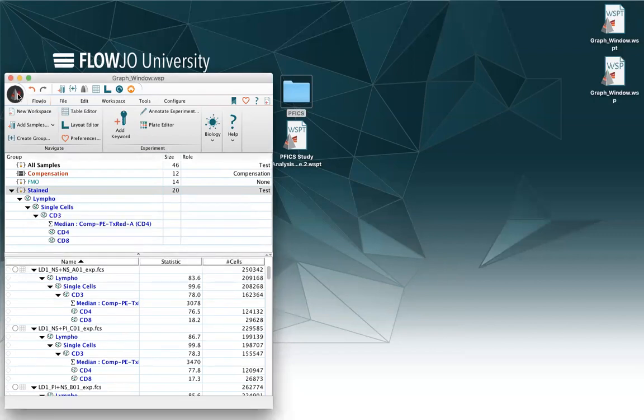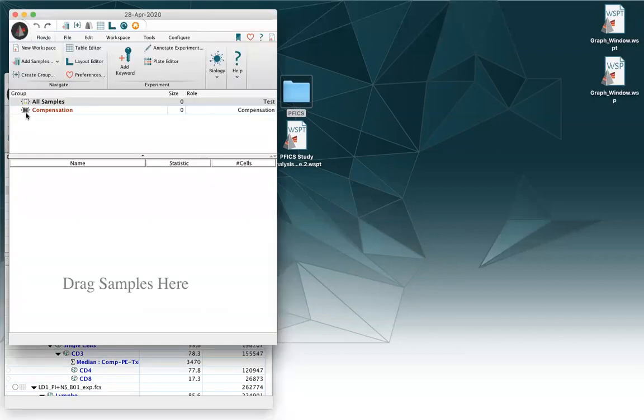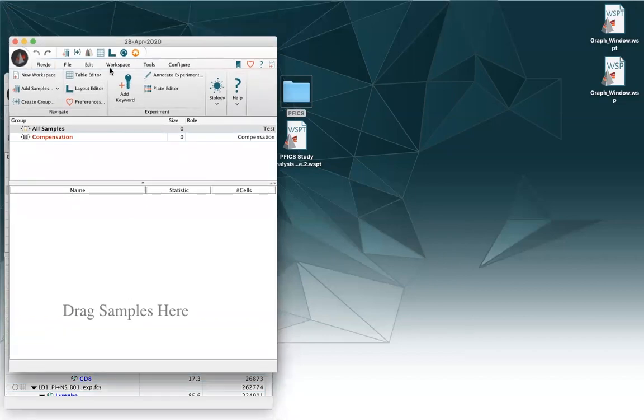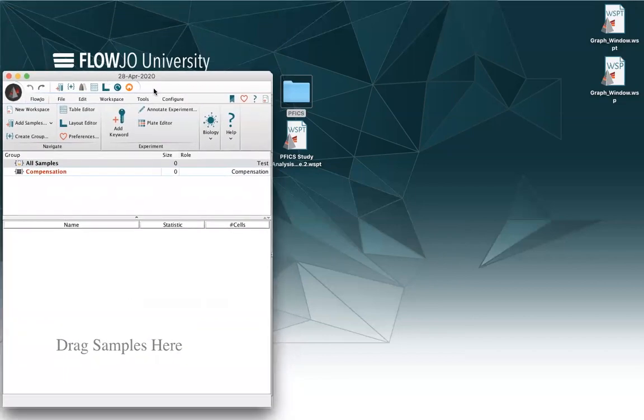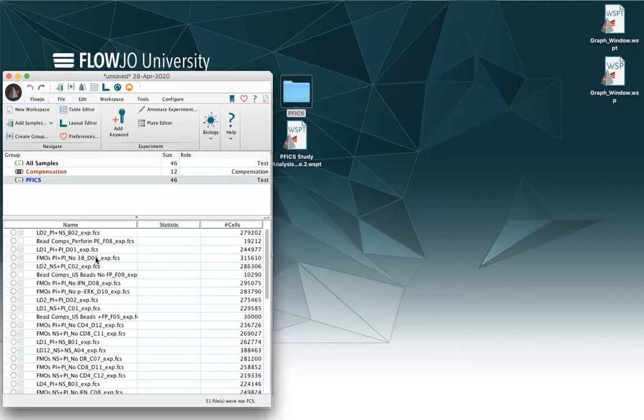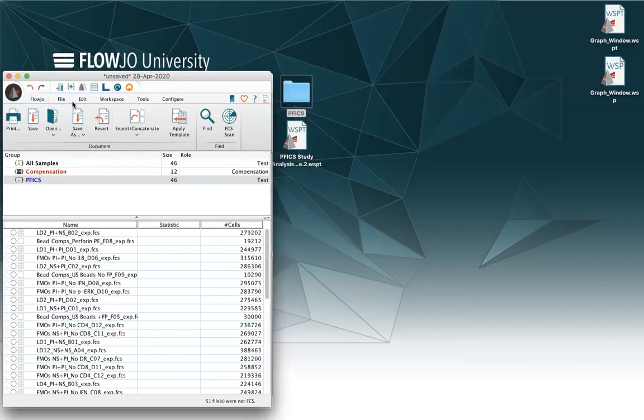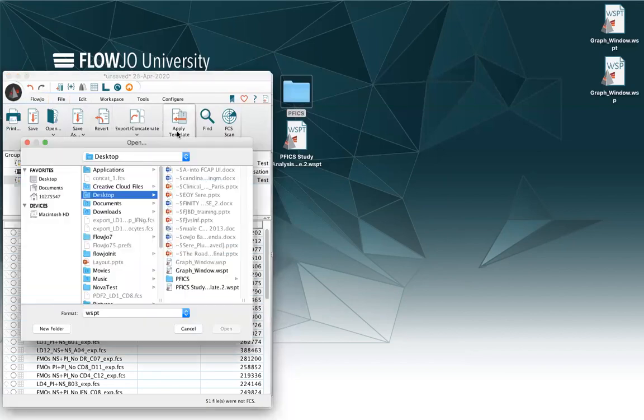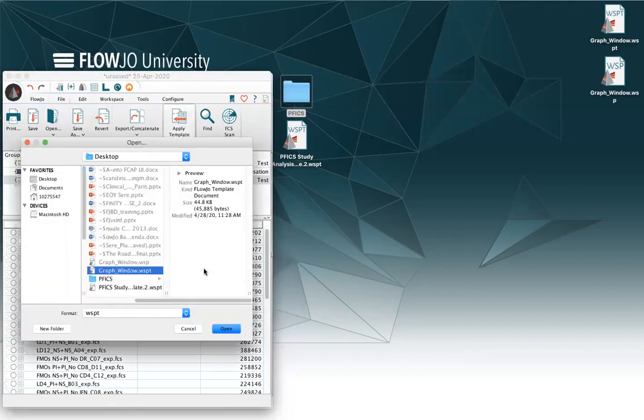I can close it, and if one day I want to open a new workspace and load samples in it, and then I realize that I have a template that I want to use to analyze this data, I can click on File, Apply Template, and select the template that I want.